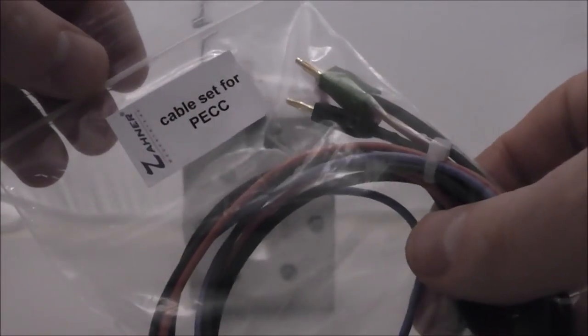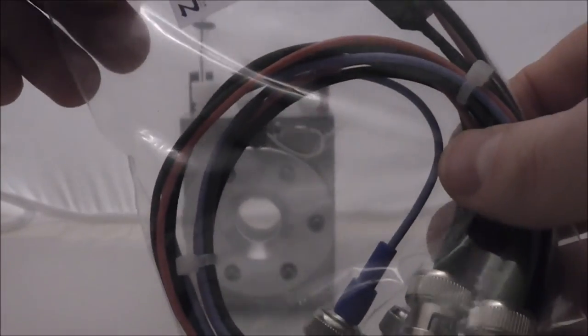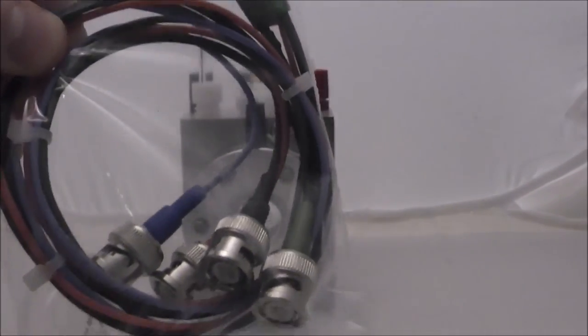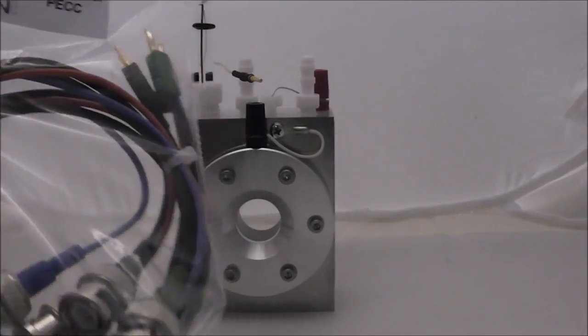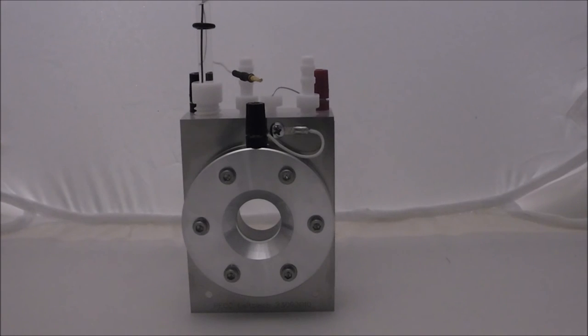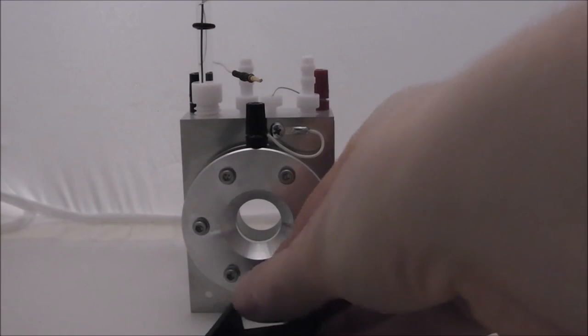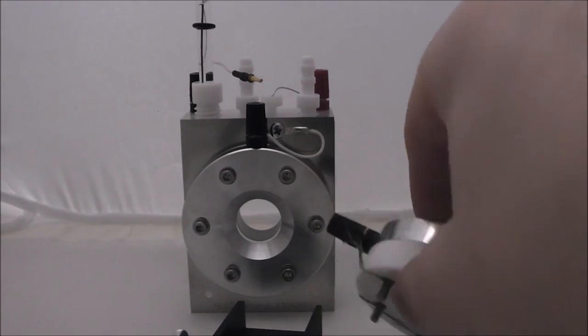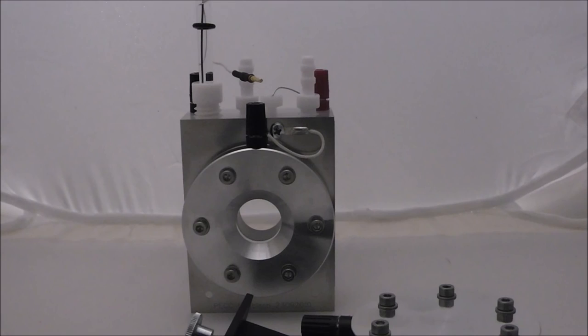They include a pack of BNC connectors so that you can connect to the front of the Zahna Potentiostats and their SIMPS systems. Zahna makes a really nice job of including all the accessories, so that once you get the PEC2 cell, other than putting your chemistry in there and your working electrode, you're really good to go. It's a very nice, complete solution.